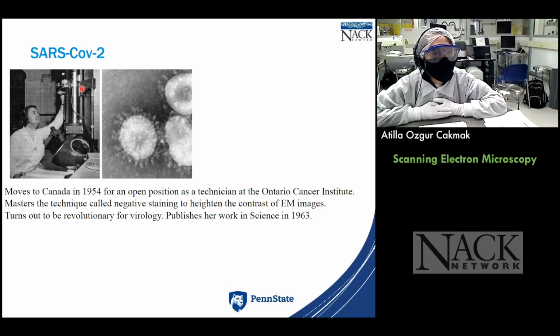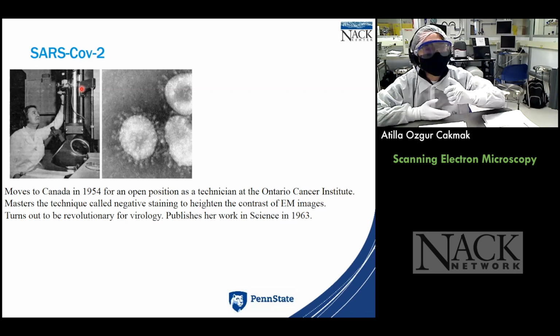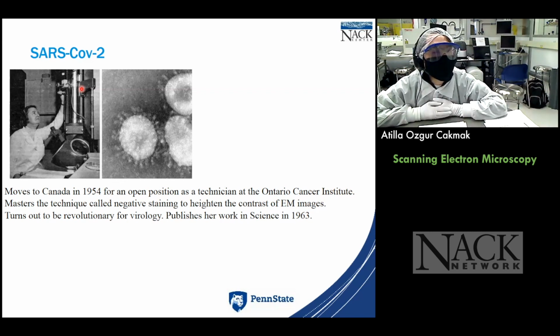Around that time, electron microscopy imaging of viruses was very painstaking, and people thought that it had no future. But let's remember the size of the viruses. They are less than 100 nanometers, so you have to use electron microscopes for sure. But people could only get information from viruses in very purified, concentrated samples.